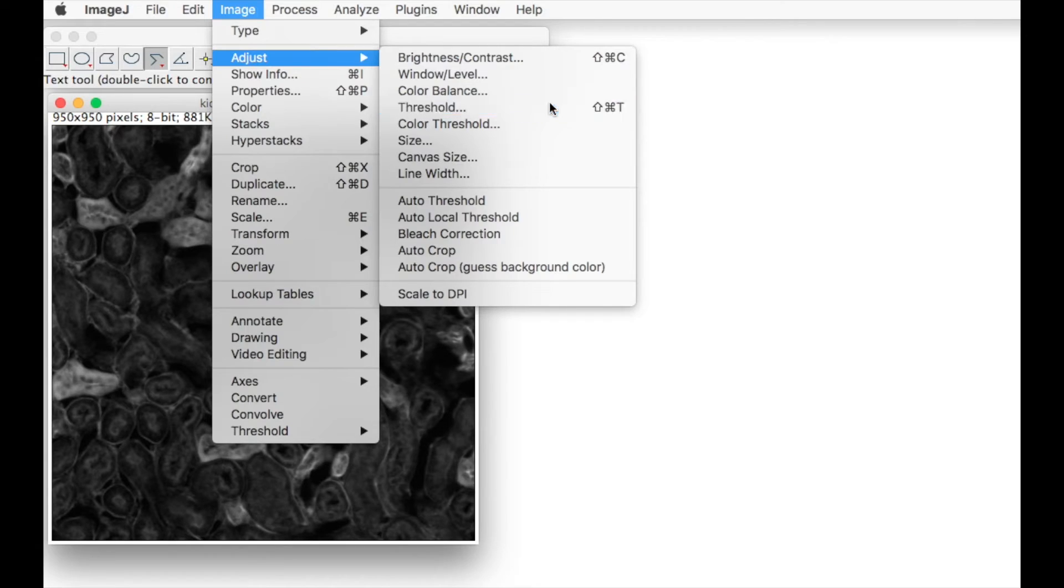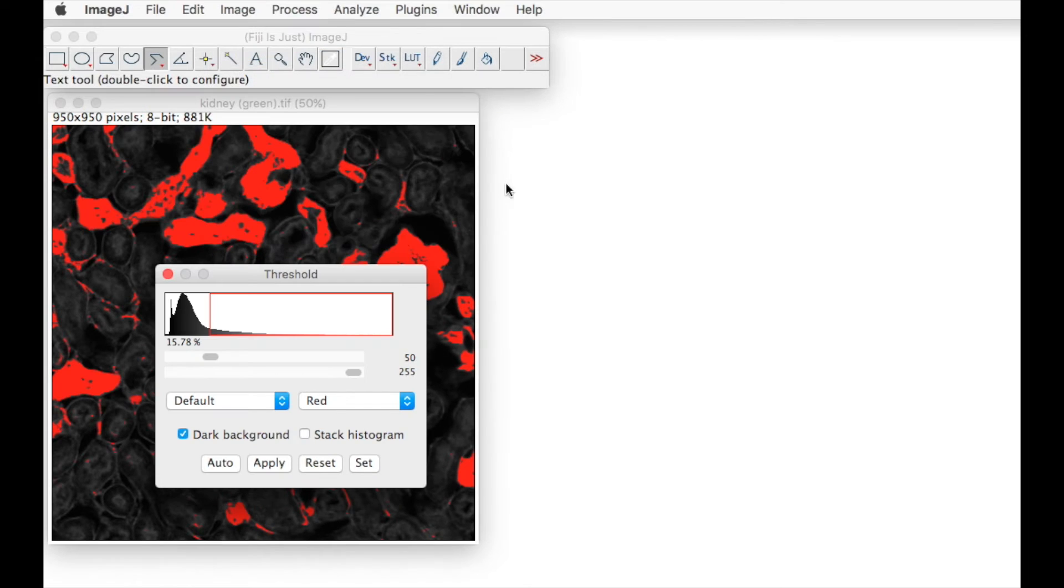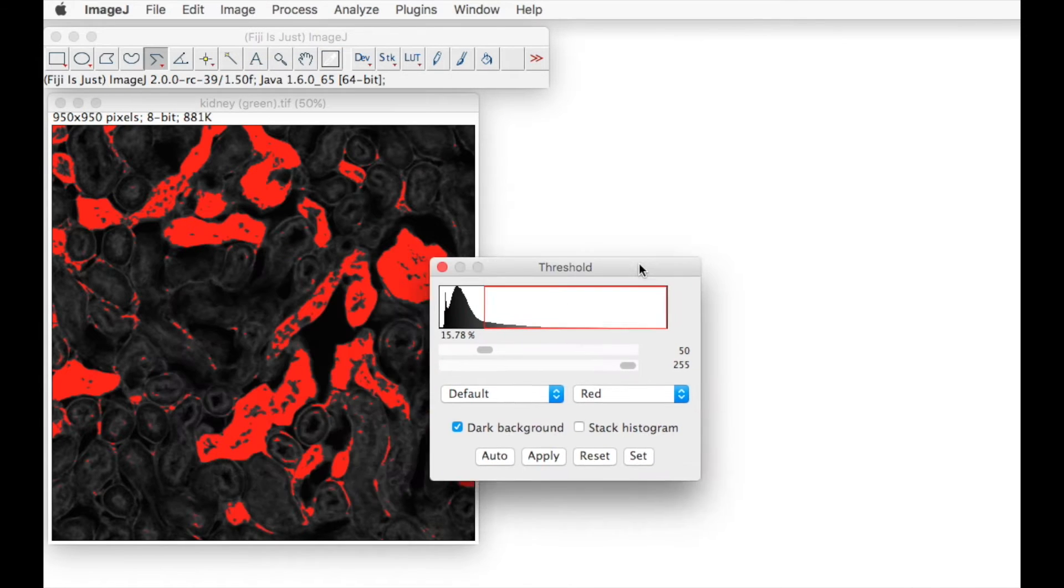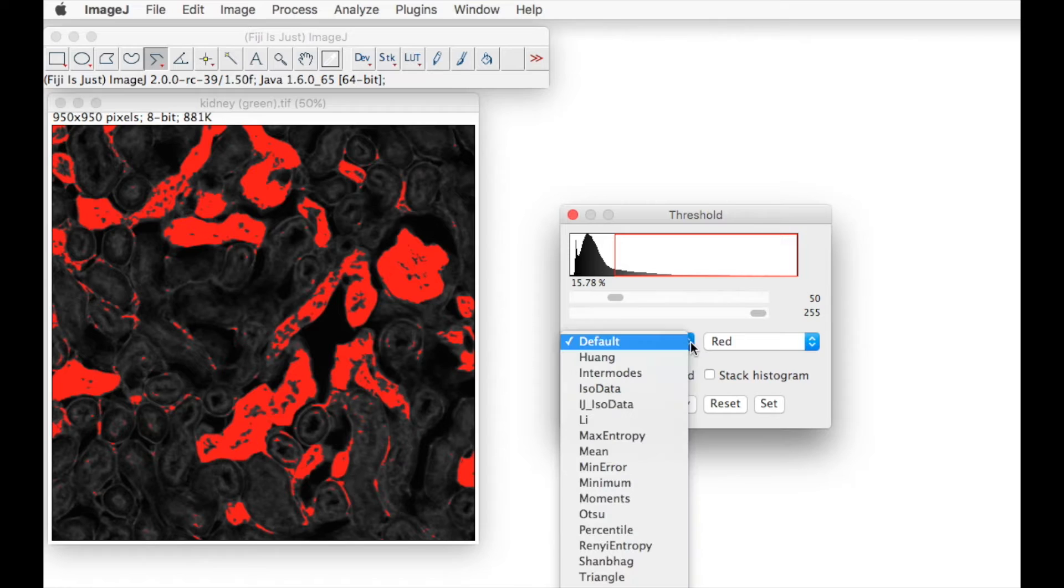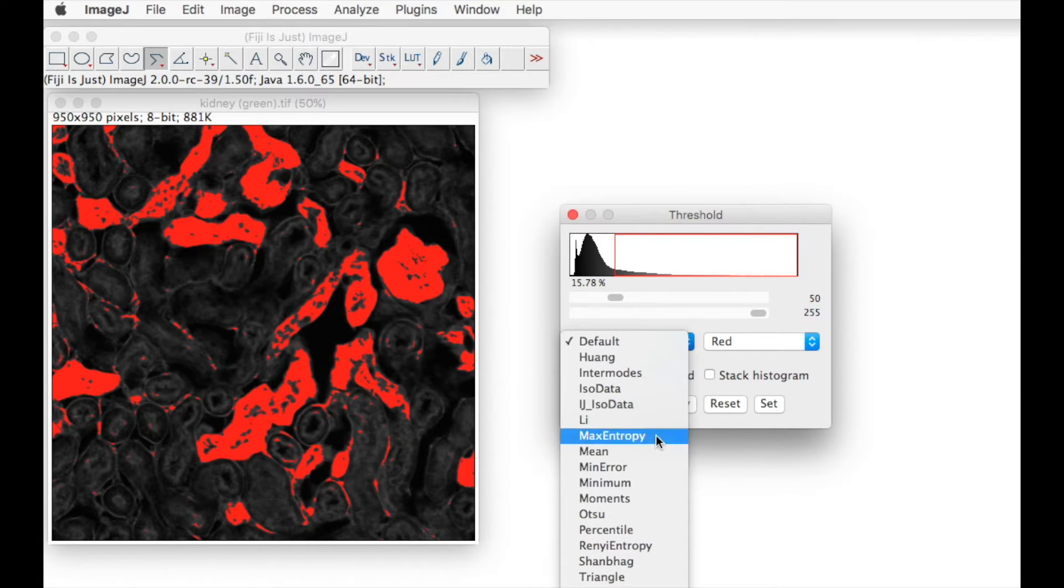Normally we would go to image, adjust, thresholds. We can manually adjust threshold levels and the type of threshold applied.